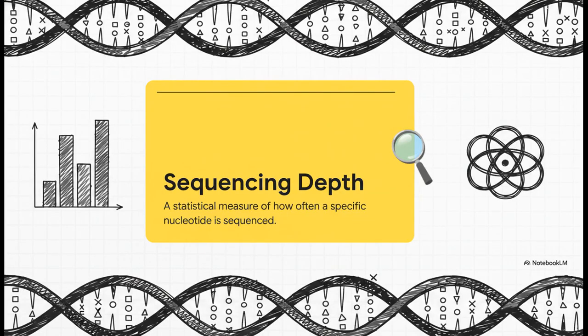Another key concept to keep in mind is sequencing depth, which is also known as coverage. This is just a statistical measure of how many times a specific nucleotide in the genome has been sequenced across all the reads in your run. So for example, 30x coverage means every single base in the genome was read an average of 30 times. This is absolutely vital for accuracy. You want to read the same base multiple times to be 100% sure your sequencer didn't just make a random mistake. Think of it like proofreading a paper a few times to catch typos.